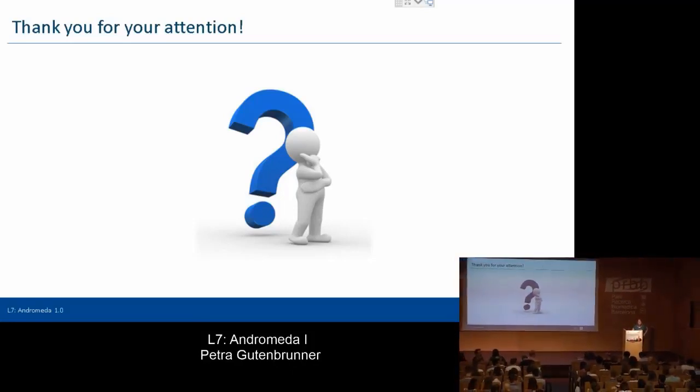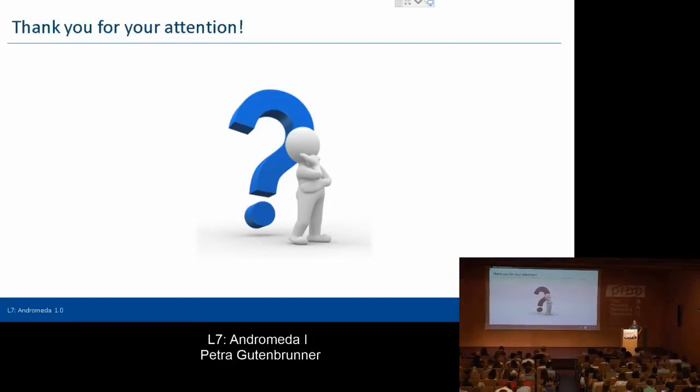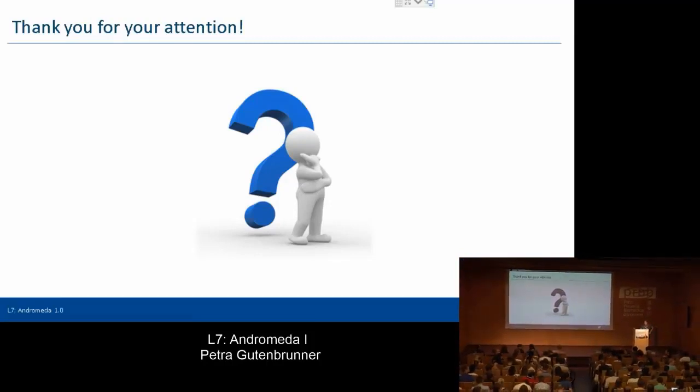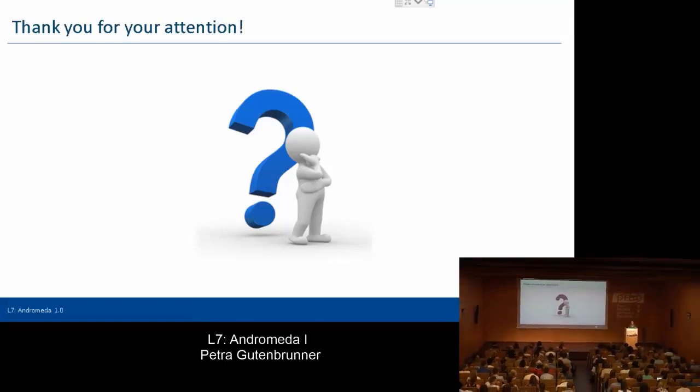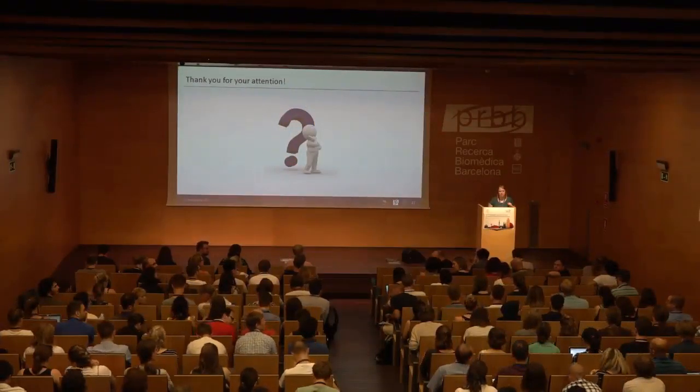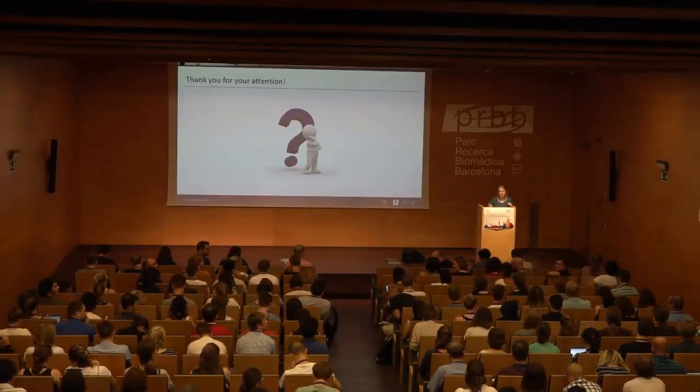Thank you. I have a question about the number of variable modifications. How many variable modifications make sense in the end if you analyze this whole lysate?